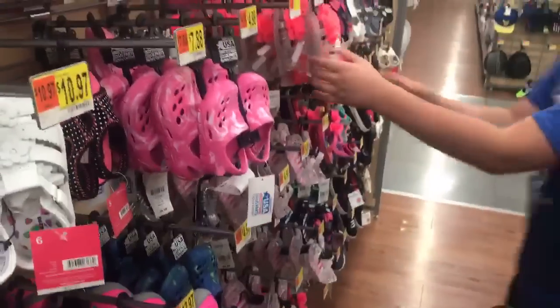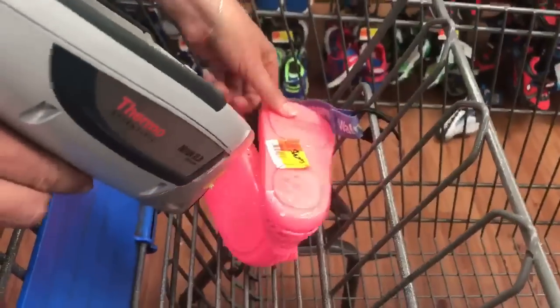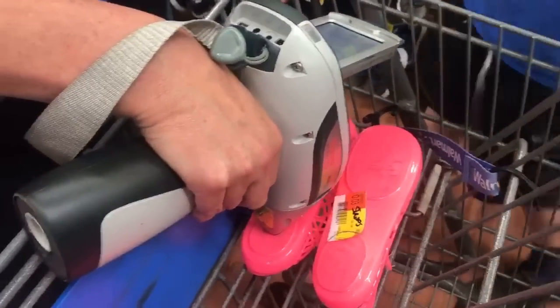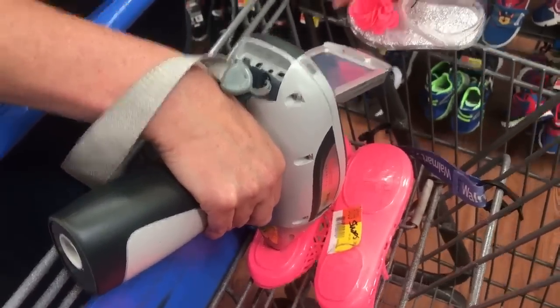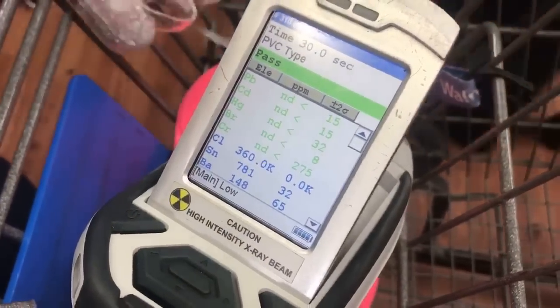No lead in these. Two pairs of jelly shoes and no lead so far. Maybe the opaque ones — the pink ones with a bow? These are like different jelly shoes. Let's grab a brand new pair just in case — we have a control. I'll be really surprised if these have lead. I mean, plastic can't have lead, but with Walmart, you know, they've been sued about things like this before. No lead, no cadmium, no mercury, and no arsenic on these shoes.